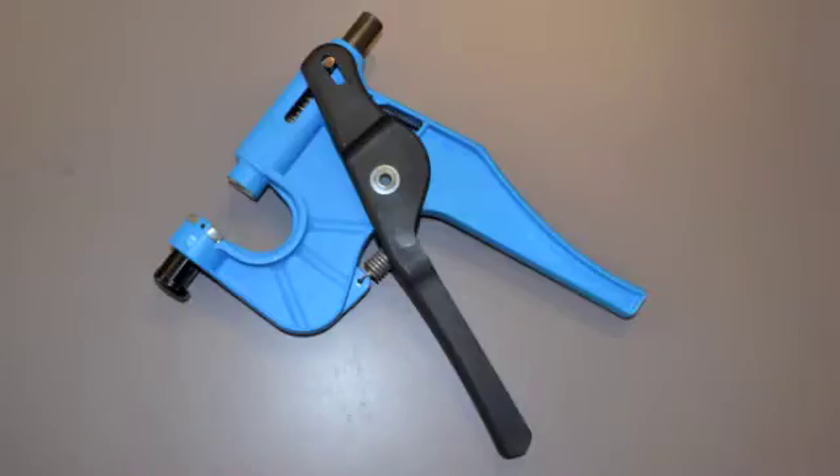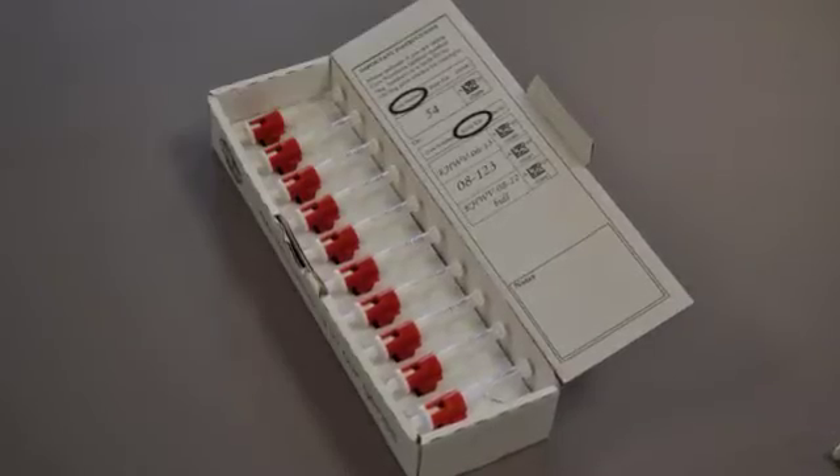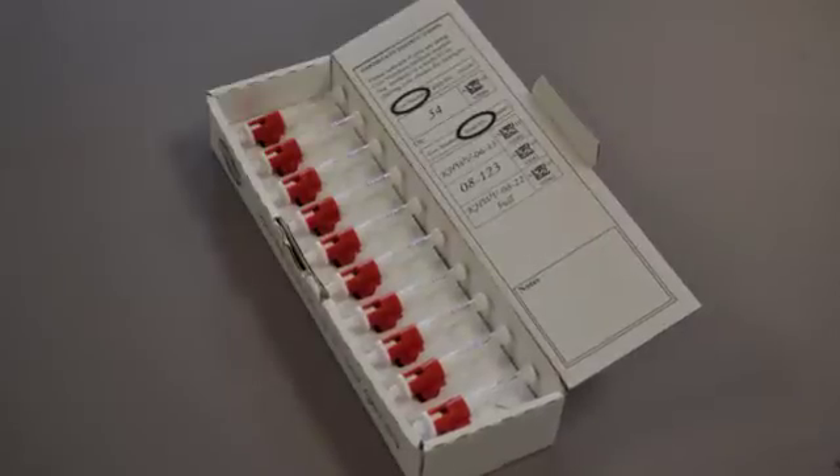In order to collect tissue samples, you will need an Allflex tissue applicator and a supply of tissue sampling units. The applicator is slightly different than a traditional ear tag applicator. Let's take a closer look at the tissue sampling unit and how it functions.